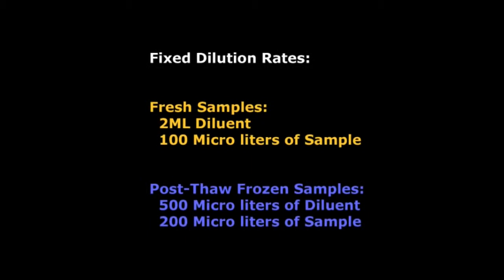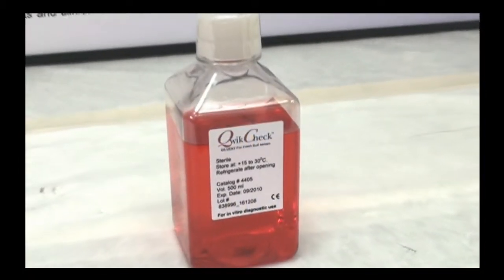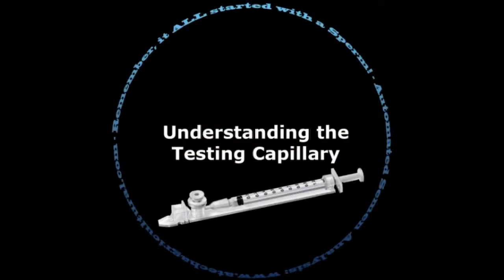Testing fresh and frozen samples requires a fixed dilution. Bottles of dilution media for both sample types are included in the test kit. To test a sample, a testing capillary needs to be filled with preheated and diluted semen. There are 3 primary sections.